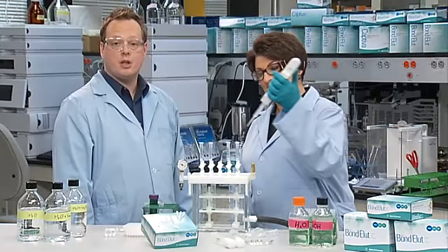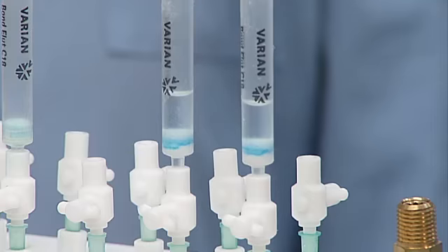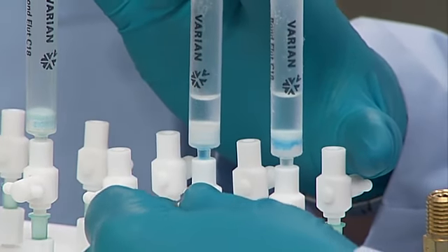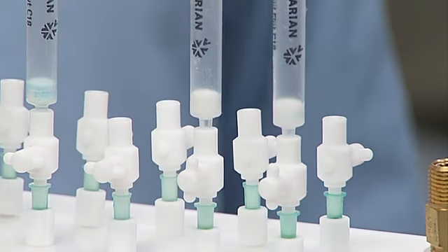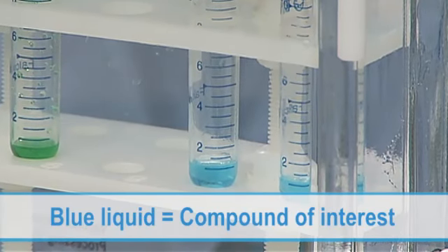Optimizing the elution step is critical because it will help to yield a clean, interference-free eluent, producing optimum recoveries. The elution step can also be optimized in terms of both organic solvent and pH. There is a link available in the notes which offers tips to optimize your SPE method. Now that we've covered a couple elements of optimization, you can utilize SPE as your sample preparation technique with ease and confidence. Remember, choosing the correct packing format of SPE material will be critical to the quality of your results.